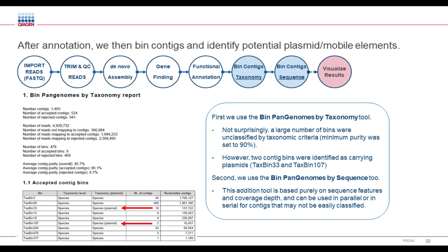But more importantly, the individual contigs now have been labeled and annotated so that you know which bin they belong to. And if there's a particular organism or set of genes that are of interest, you now have a way to search through that list of genes and filter out individual sets of contigs that belong to a taxonomic binning group, which you can then do further downstream analysis on.